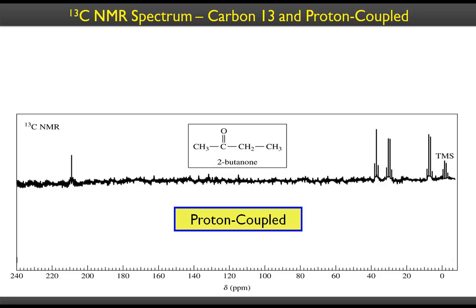So how about the other way around? All the carbon-13s would have magnets attached to them because if they are not quaternary ones, let's say if they have primary C13, secondary C13, tertiary C13, then they would have different number of hydrogens. For example, this CH3, if it were to be C13 carbon, it has 3 magnets attached to it. So n+1 rule should give us a quartet. This carbon should be a quartet. And this would be a triplet because it has 2 magnets attached to it, right?